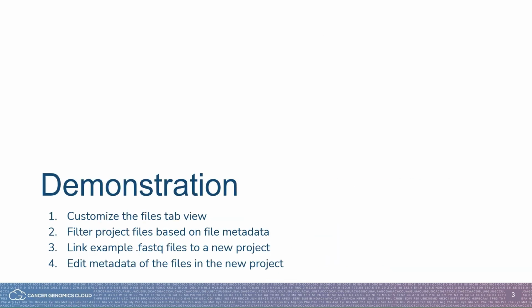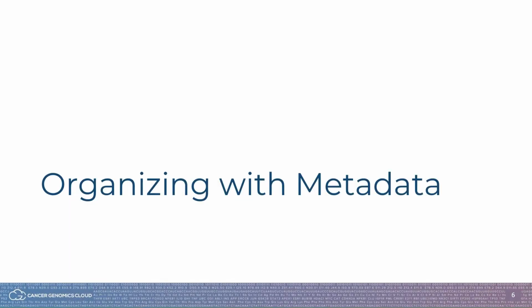In the demonstration, I'm going to teach you how to customize the Files tab view, filter project files based on file metadata, link example.fastq files to a new project, and edit metadata of the files in the new project. First, let's look at organizing with metadata.